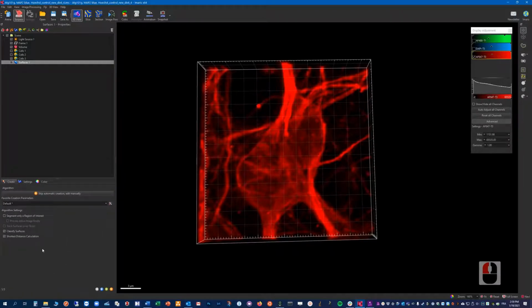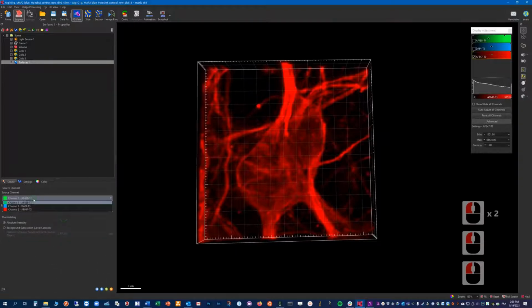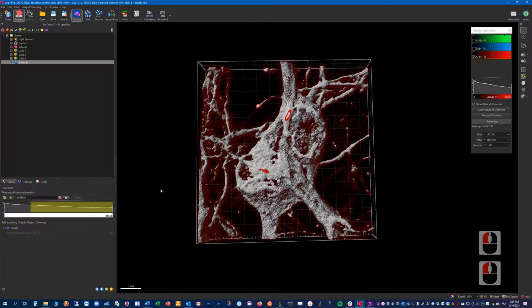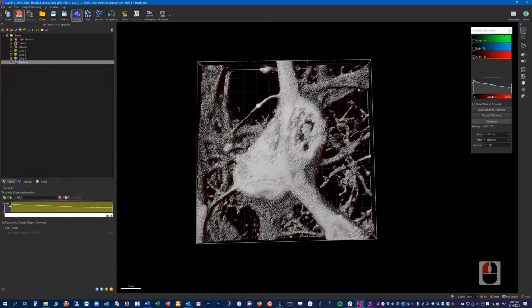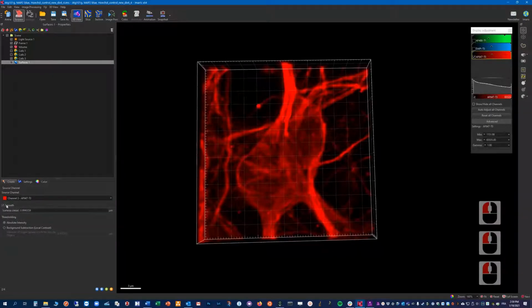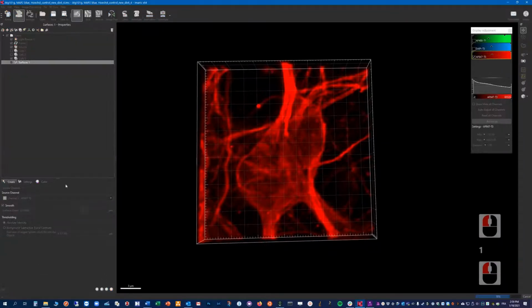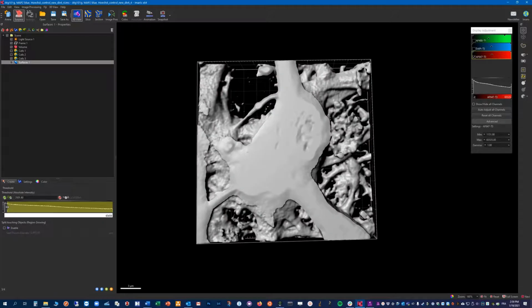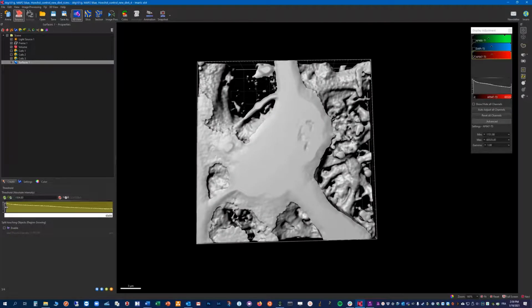and what we want to do here, we don't want to classify, etc. We just want to create quickly one surface of channel 3. We don't want to smooth it whatsoever, and we want to include, maybe you want to smooth it a bit because it's really looking a bit too noisy to my taste. So just slightly, 0.1 should do the trick. Yeah, something like this. So everything you see here will be part of the new duplicate channel.